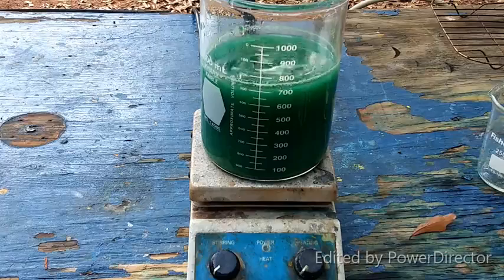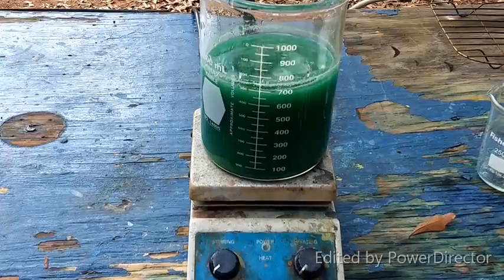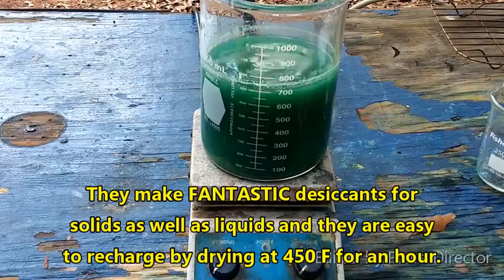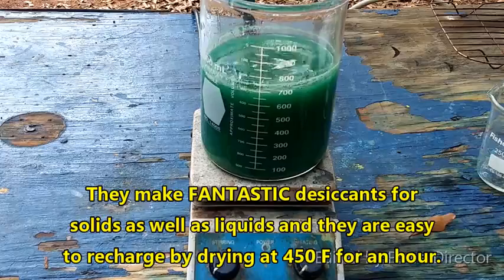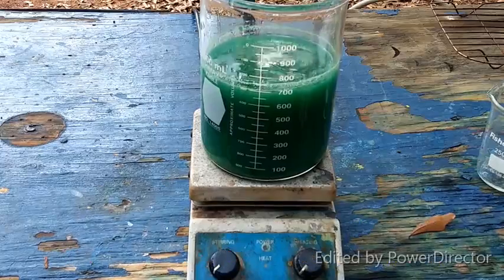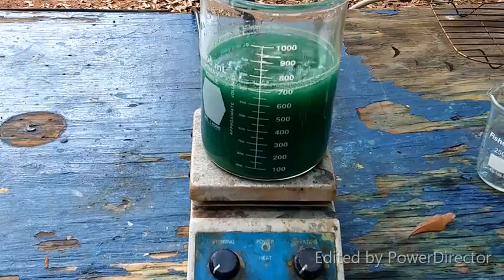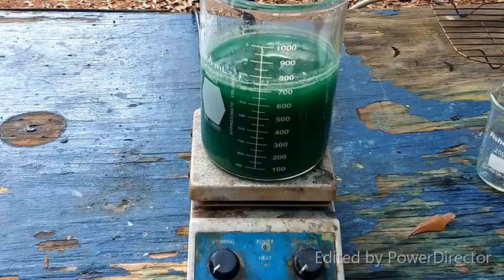But for now, I'm just going to recrystallize that other anthranilic acid, that crude stuff. Right now, I've got it drying out in a desiccator over 3 angstrom molecular sieves. Besides using them to dry out your solvents, they also make great drying materials for a desiccator. They really do. They work great. But I thought y'all might like to see what copper anthranilate at least looks like. It is very pretty. So, there you go.